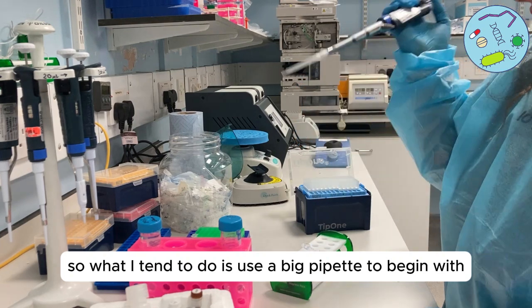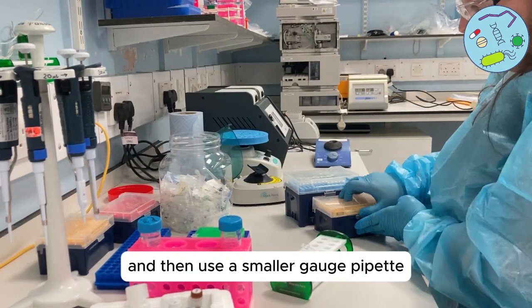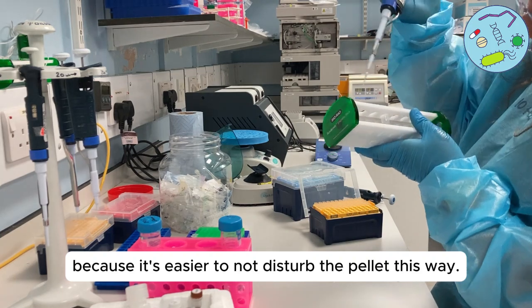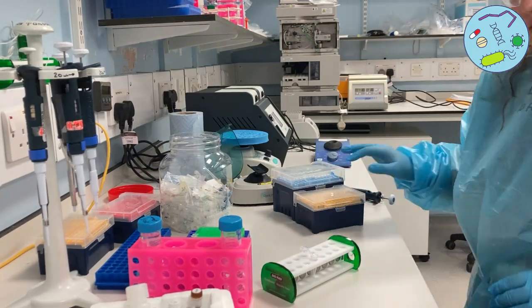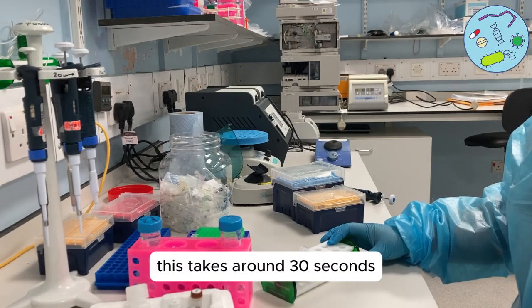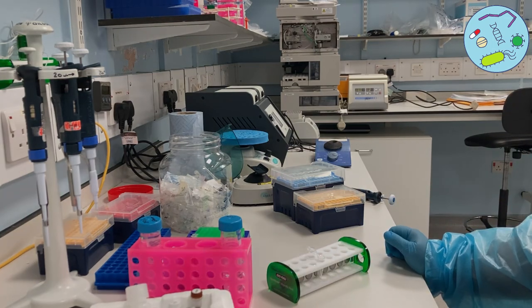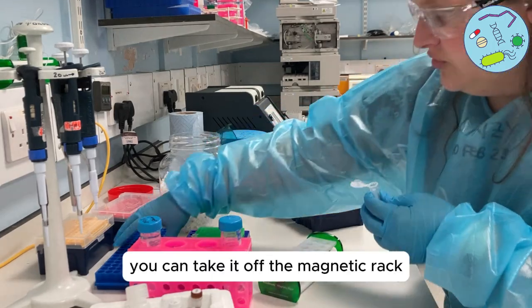This time we want to get as much of the ethanol out as possible. I tend to use a big pipette to begin with and then a smaller gauge pipette to remove the last of the liquid, because it's easier not to disturb the pellet this way. We then need to leave the pellet to dry — this takes around 30 seconds, but really it's by eye, making sure the pellet isn't too dry and also isn't too damp. Once you're happy with the dryness, you can take it off the magnetic rack.